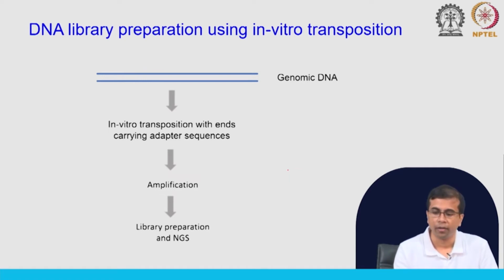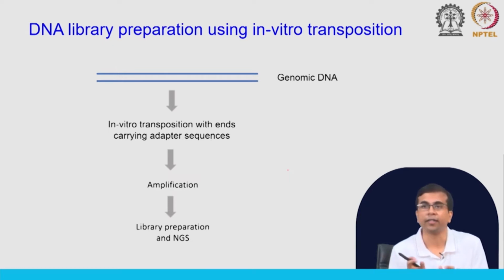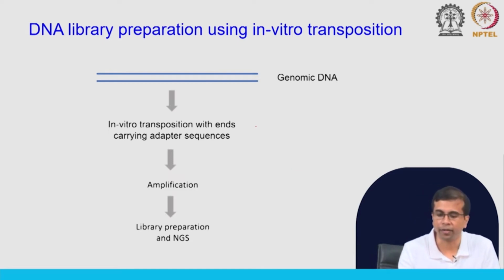Once you have isolated genomic DNA, you do transposition in vitro, in the test tube, and the sequences that are inserted contain adapter sequences. So, imagine you have this transposase enzyme, like this.